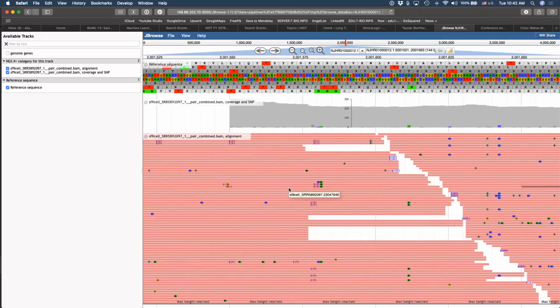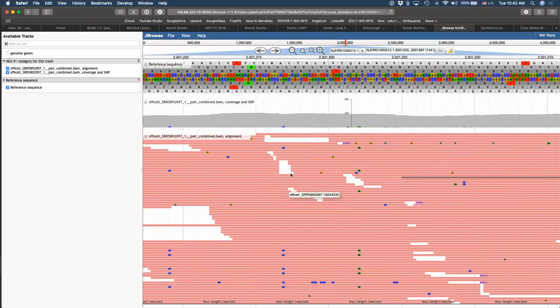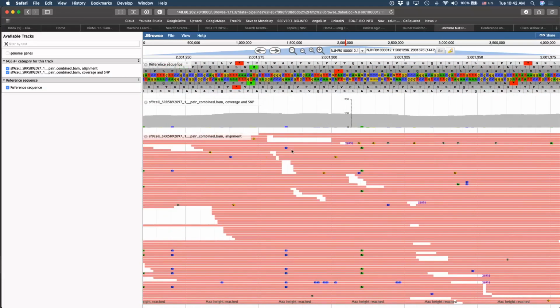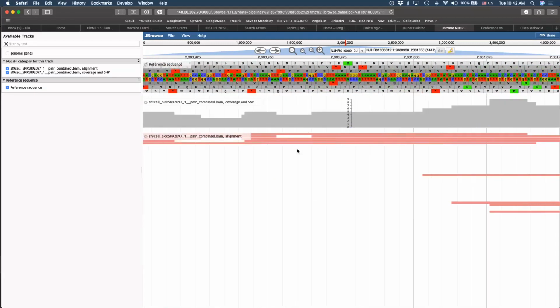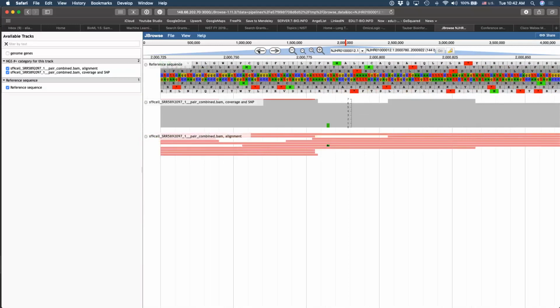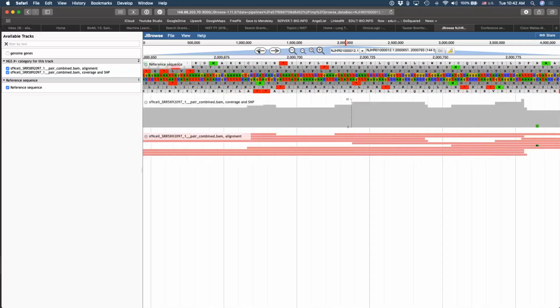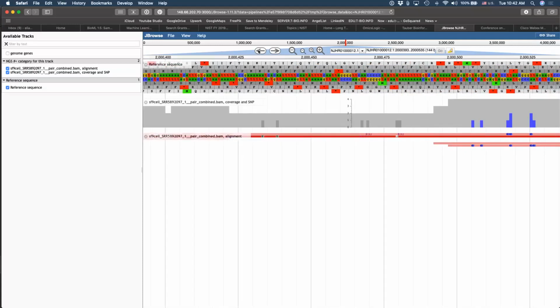As you scroll, you can navigate manually, and you will see the points over here that indicate a consistent change. Sometimes you will have a change that doesn't occur in all of the reads. Sometimes you will see a change that occurs in all of the reads. So this is just a way to visualize how those individual reads map onto the reference genome.